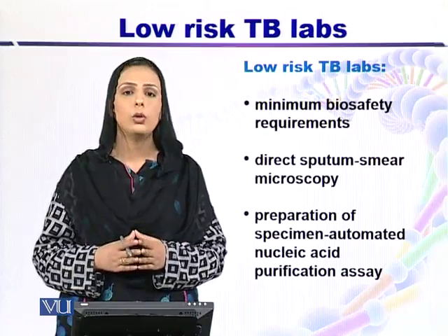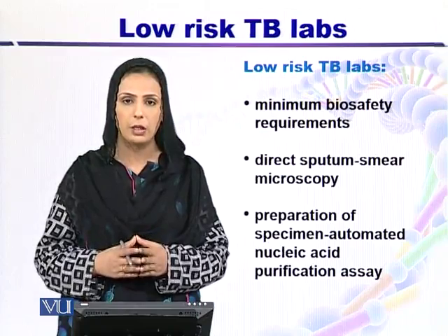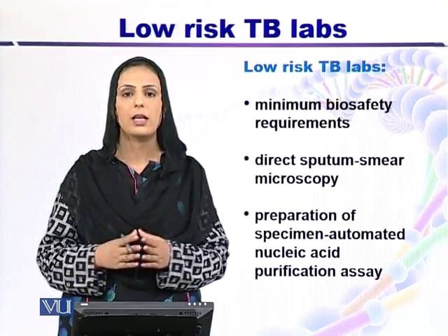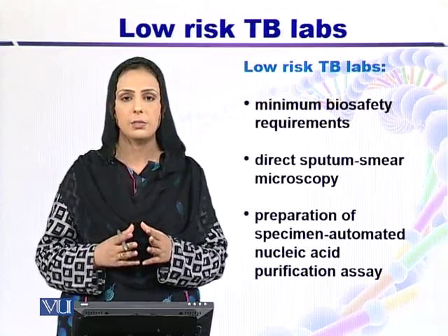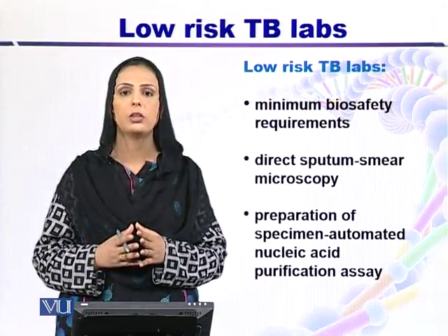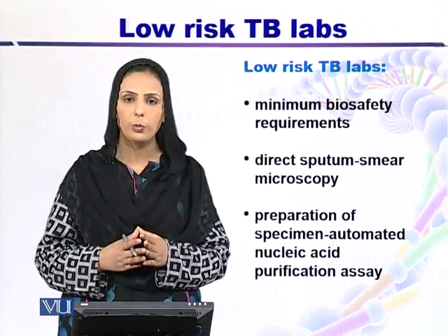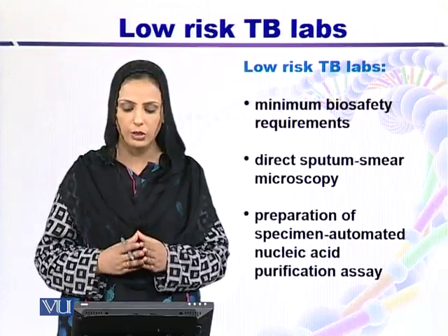So, in the low risk biosafety labs, we require minimum biosafety requirements, and there are two procedures involved. First is the smear preparation, and the second is the specimen preparation for nucleic acid purification. So these are the two procedures in which there is a low risk of aerosol generation.